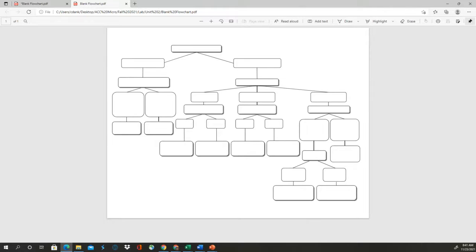Remember for us, over here was blood agar, and so it was differentiated by, over here it was blood agar. So we had beta, alpha, and gamma, right? So the different observations and results. And then based on that, well, if we had beta, then we needed to do this other test that would allow us to get to strep pyogenes or strep agalactiae or whatever, okay? So make sure that you're not just doing a glorified table, and you're not just doing individual pathways for each individual organism. You need to be connecting the tests and how the tests help you figure out which organism you have.